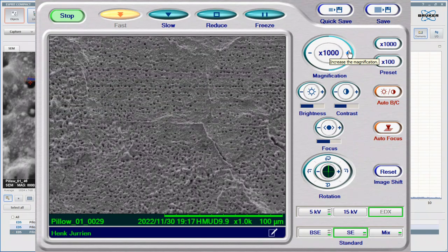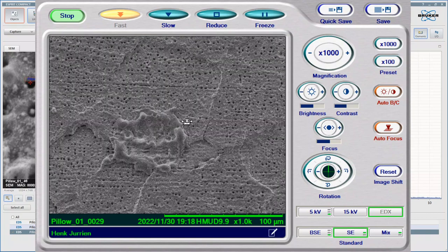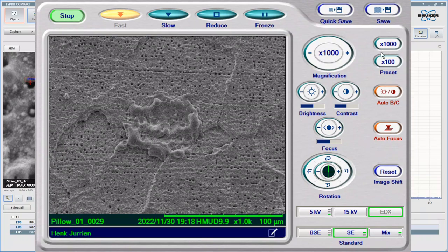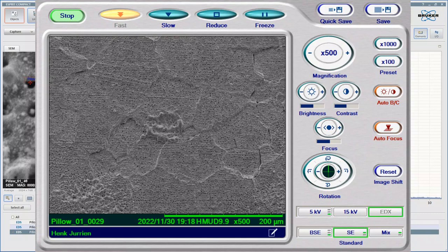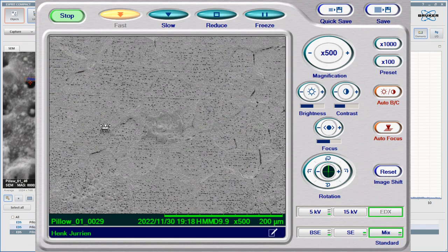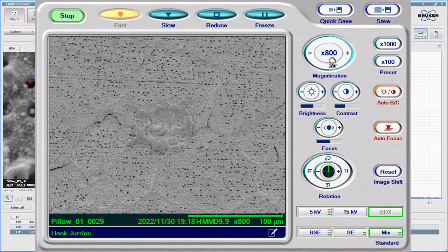Now here you can see quite a linear line there, all the way across, even across the crystal grain boundaries. So this might be the brushing on the brass that is playing a role here. This looks like a large impact. Now you can't see anything going on around that until we change the sensor so that we can see maybe different elements. You really get an idea of the linear effect here, going all the way across those individual crystals.